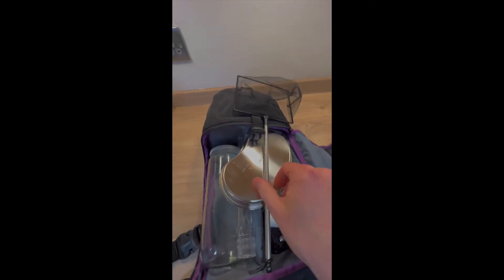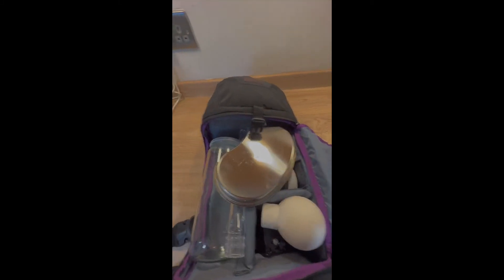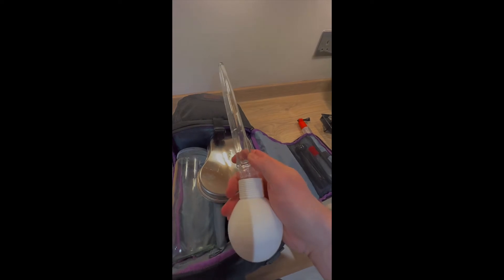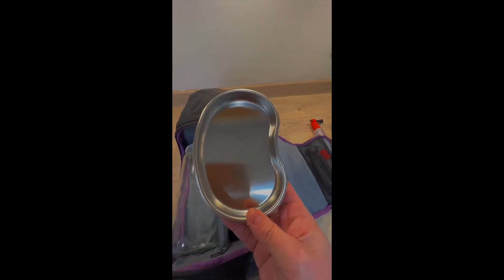I've probably got an overkill of stuff at the moment, but I just want to try and find out what's good and what's not. So I've got a small pond dip net in there. I have a turkey baster for taking large samples, and a small kidney dish to receive the sample.